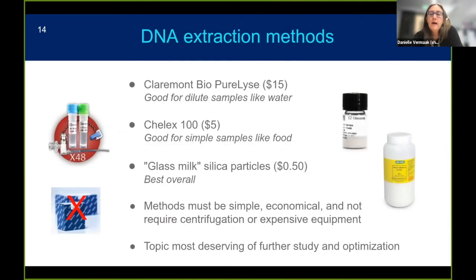So a large part of this was making DNA extraction cheaper and easier. Normally, if you're in a lab, you would just go to the QIAGEN kit, but we didn't want to do that because of cost.